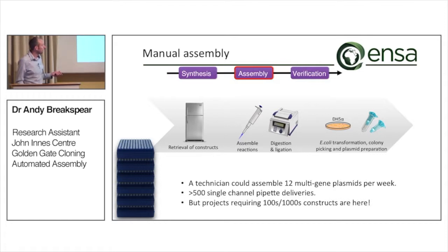So this was great in the very early stages. A technician such as myself could put together maybe around a dozen of these per week, maximum. And it's a little bit risky because just to do a dozen constructs, and it does depend on what you're doing, you could easily be looking at more than 500 single-channel pipette deliveries. What we do are bespoke reactions. Each reaction has different promoters, different CDSs, tags, etc. So they don't lend themselves well to multi-channel pipettes.